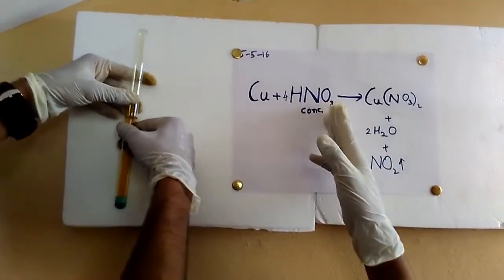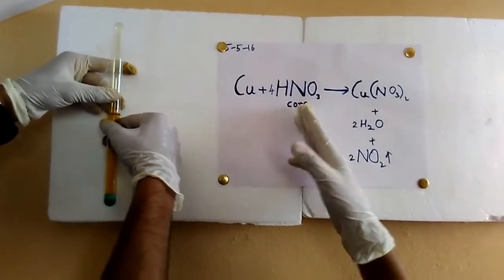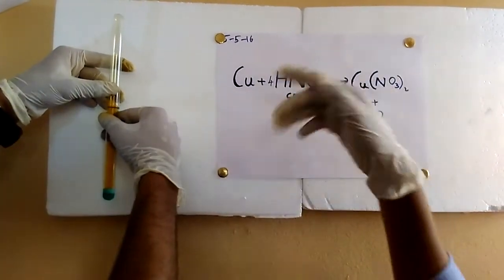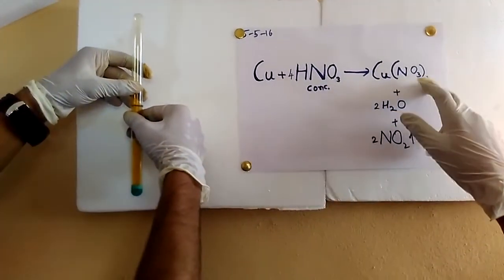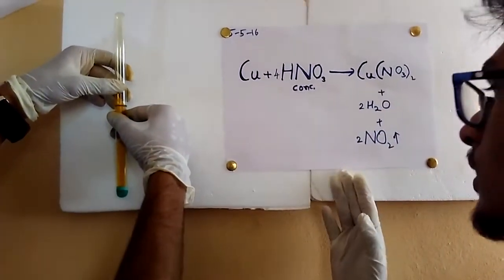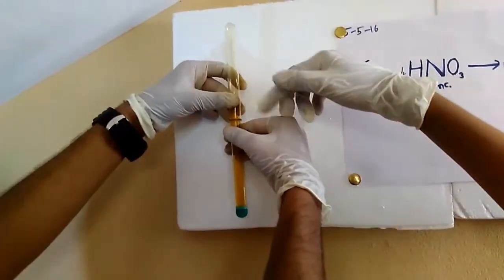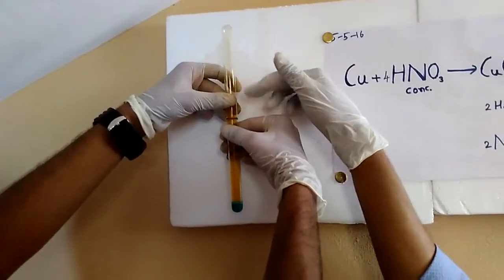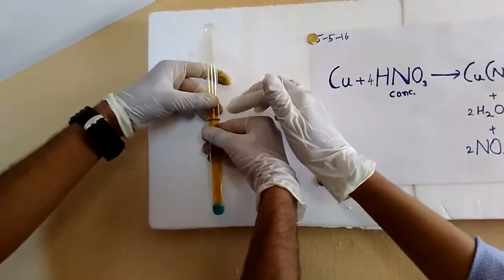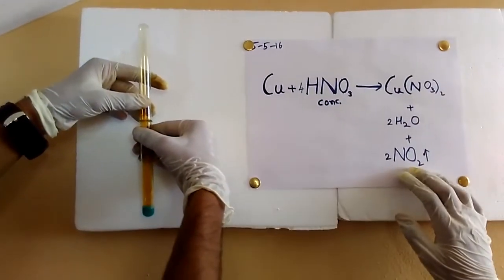Cu plus 4 HNO3 which is concentrated HNO3 gives us copper nitrate. Here the blue solution is nothing but the copper nitrate. And water as usual it will be formed. And nitrogen dioxide is nothing but this reddish brown color gas you can see here. It is nitrogen dioxide. So this is the reaction.